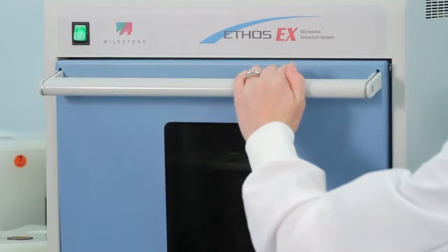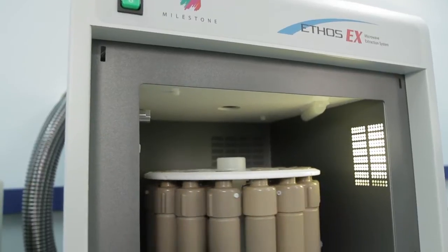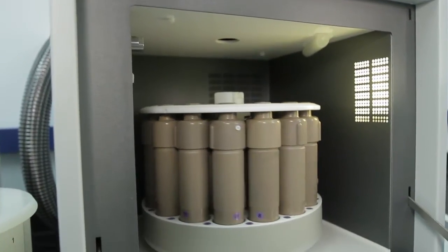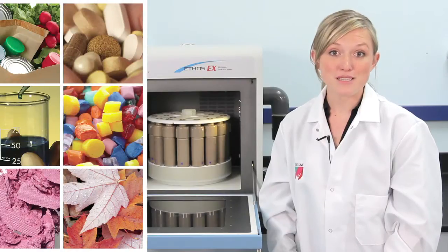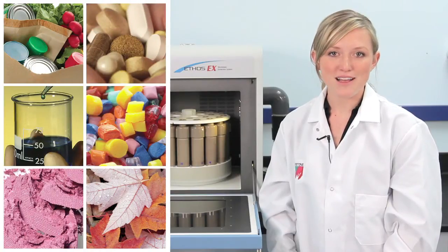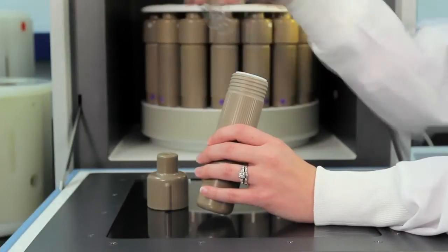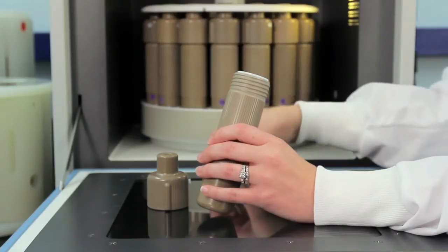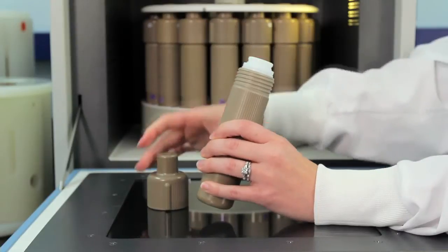Up to 24 samples can be performed simultaneously. To perform extractions on a wide range of samples ranging from environmental, API pharma, polymers, food, and other materials, simply weigh the sample into the vessel, add the solvent and a stir bar, add the cap, and just tighten by hand.